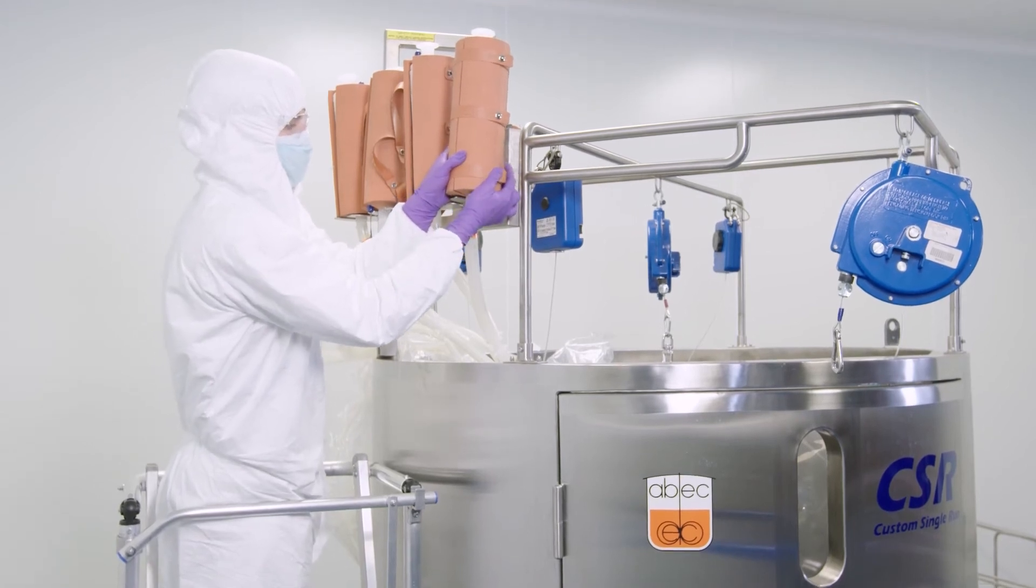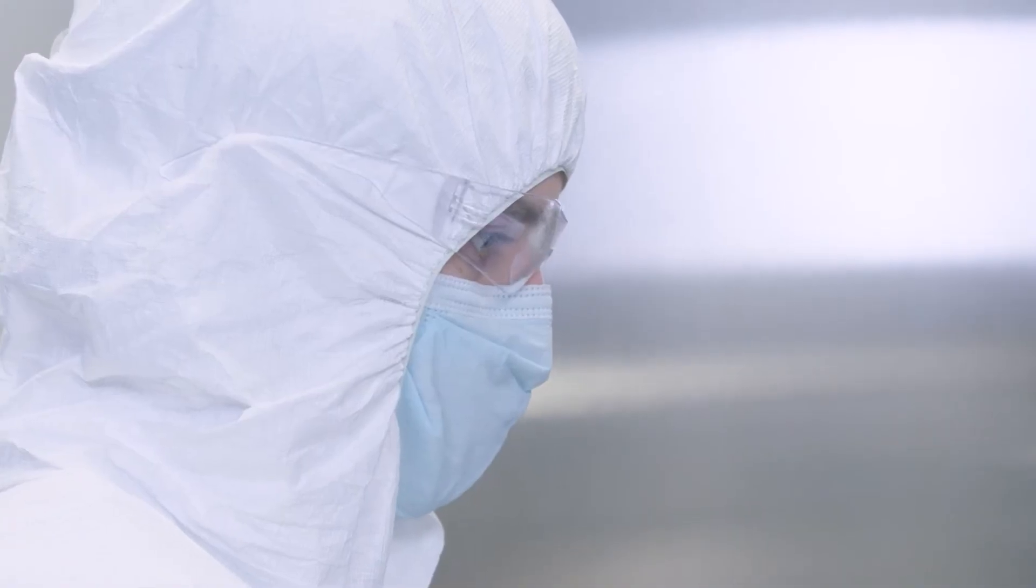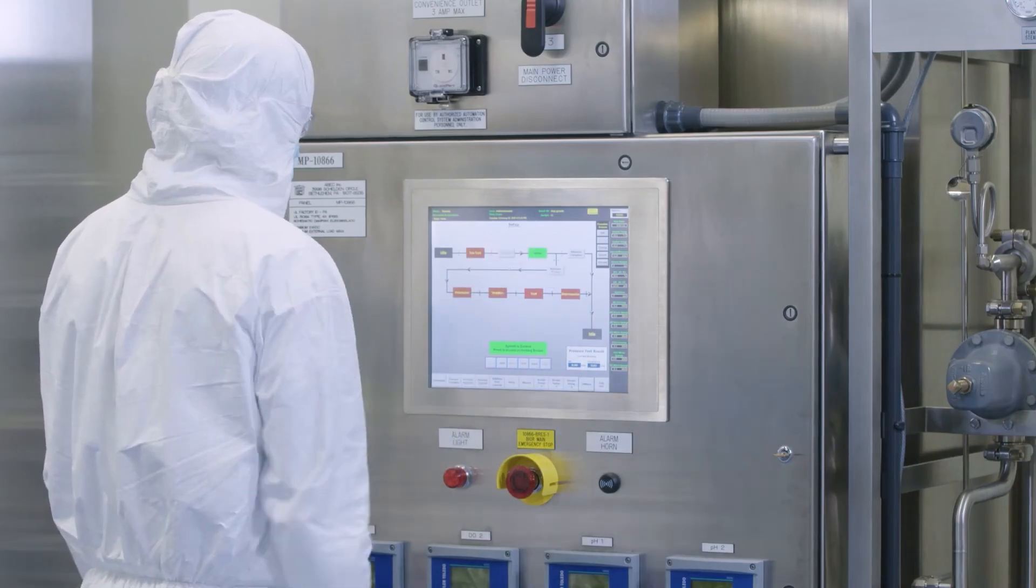Verify the integrity of the disposable container post-installation by performing a pressure hold test via the onboard HMI.